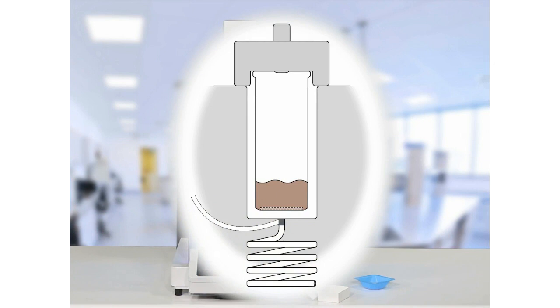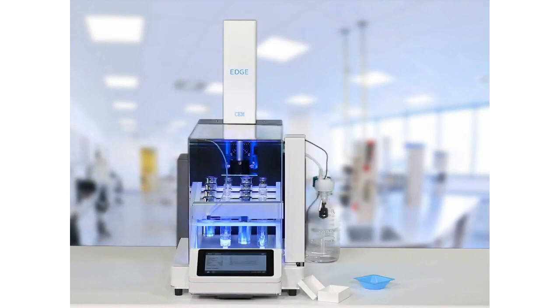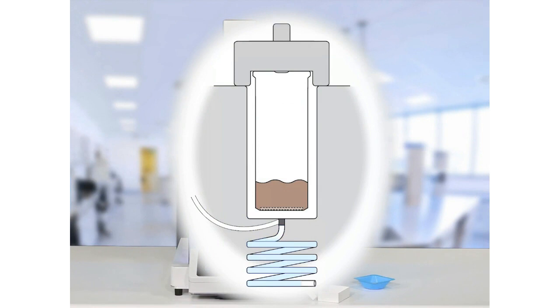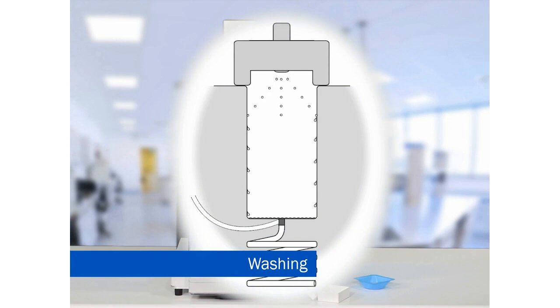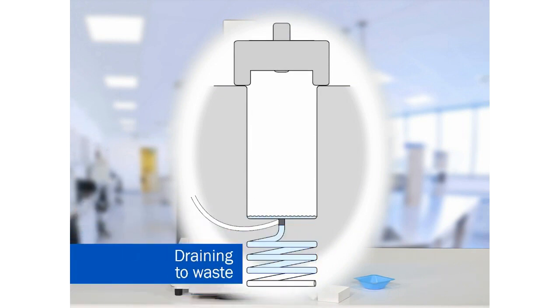We then add the option of a rinse where you can take clean solvent, run it through, and collect that as well. So you see that collecting right here. At this stage, your extraction is complete. You can be taking that and running analysis. However, we are running in series here, so we need to be cognizant of carryover, specifically for the PFAS conversation that we're having here today. So we need to make sure that we are completely clearing the system of any contamination.